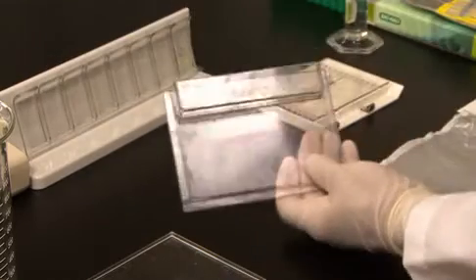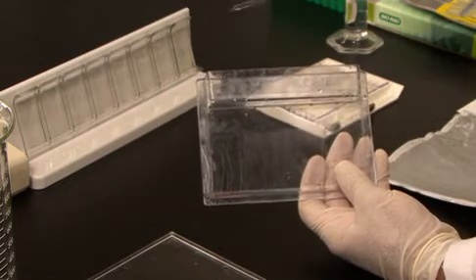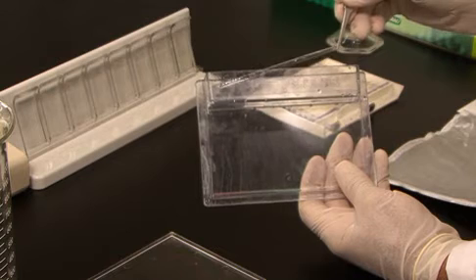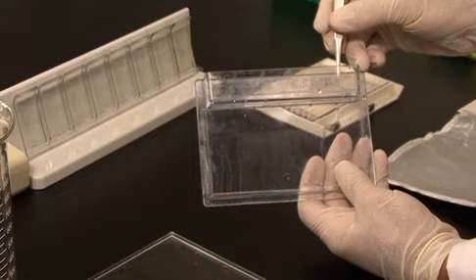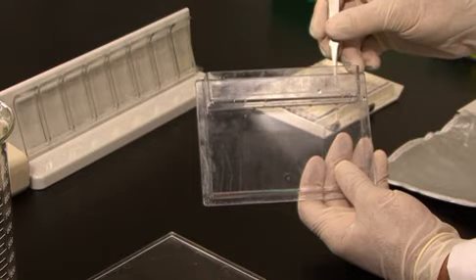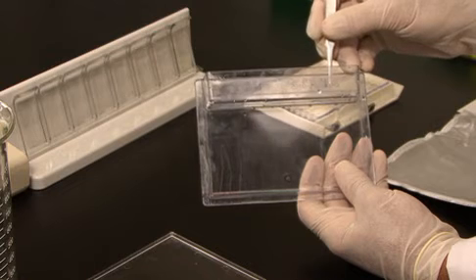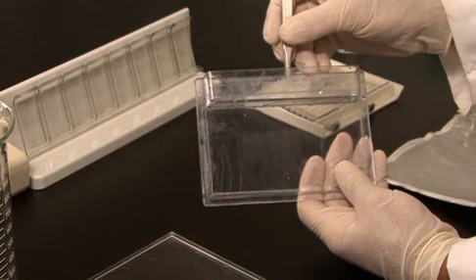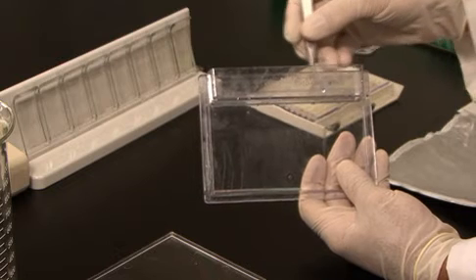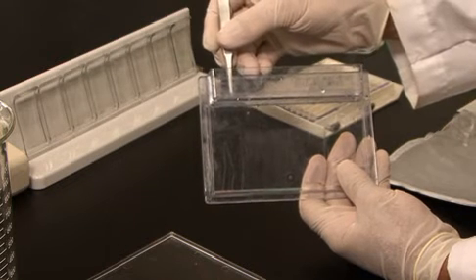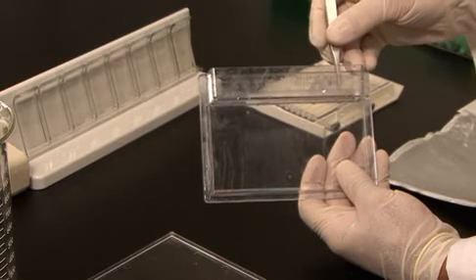Place the IPG strip gel side up. Place the plastic backing against the back of the cassette. Position the strip centered in the middle of the well with your forceps and gently push on the strip until it touches the gel. You can tell when it is touching because you will feel a little bit of springiness, a little bit of resistance. Don't push too hard.